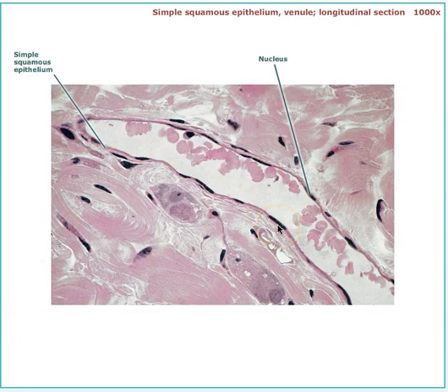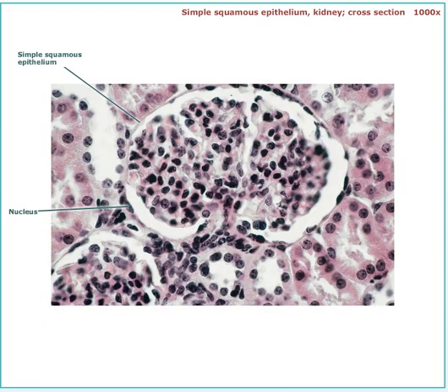More of the simple squamous. See how flat that is? The nucleus is flat and elongated. If we go back, when we looked at the nucleus of our cuboidal, it's much rounder. And you also see less space around the nucleus. So when we get to the columnar, I want you to pay attention to that space, because this space here is going to change. You're going to see a lot more of the pink area, but right now the nucleus is taking up the majority of the cell. Okay?